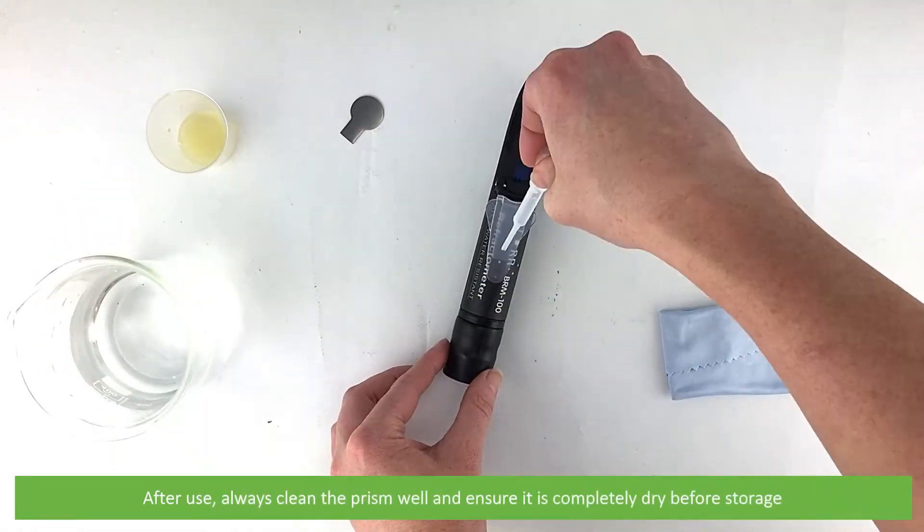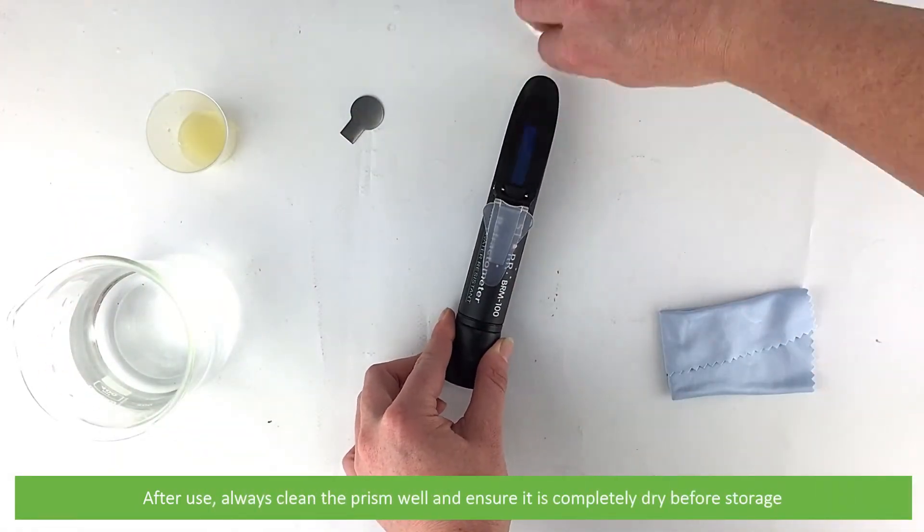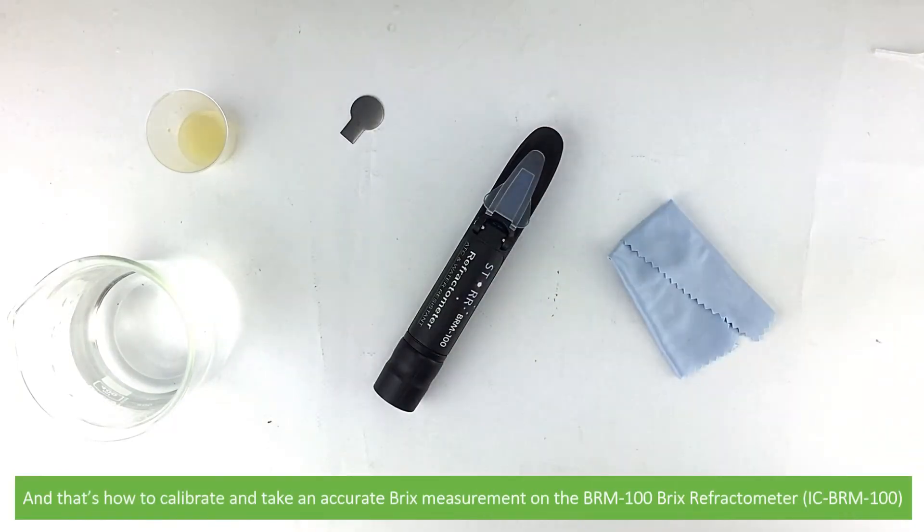After use, always clean the prism well and ensure it is completely dry before storage. And that's how to calibrate and take an accurate Brix measurement on the BRM100 Brix Refractometer.